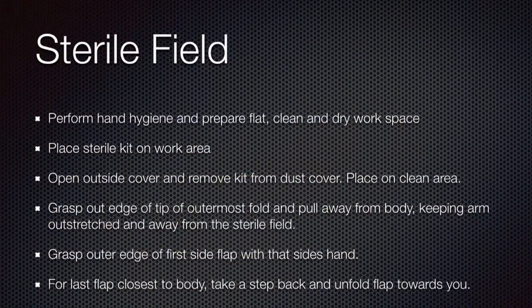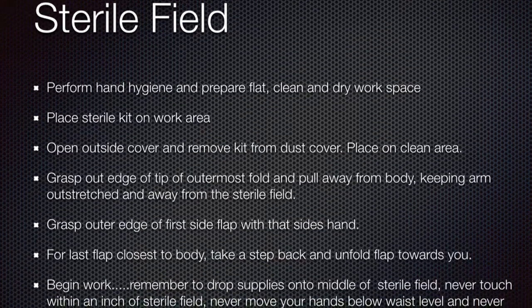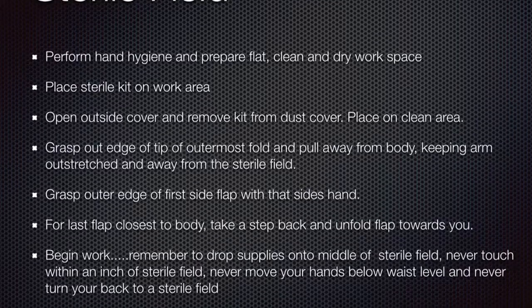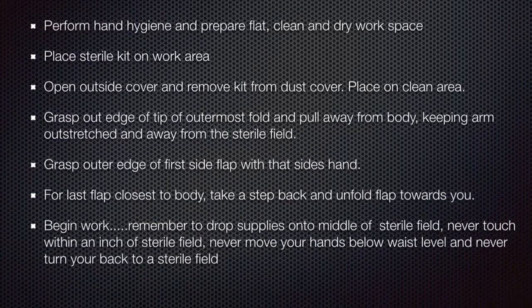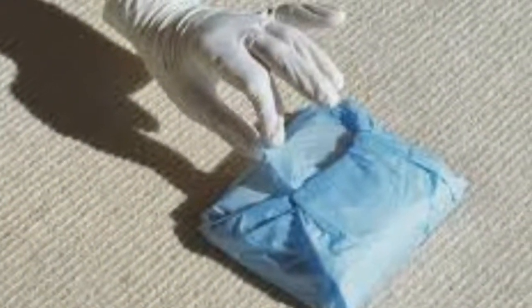And now to demonstrate a sterile field. Some of the most important things to remember when doing a sterile field is to drop the supplies onto the middle of the sterile field. Never touch within an inch of the sterile field. Never move your hands below waist level, and never turn your back to a sterile field.